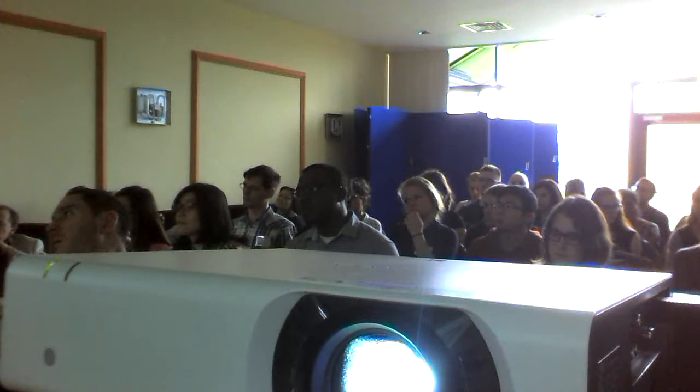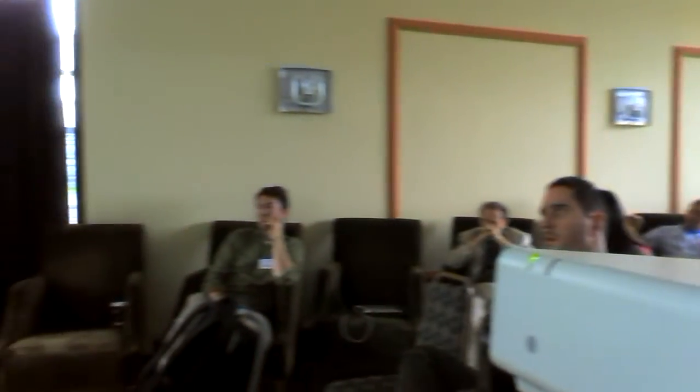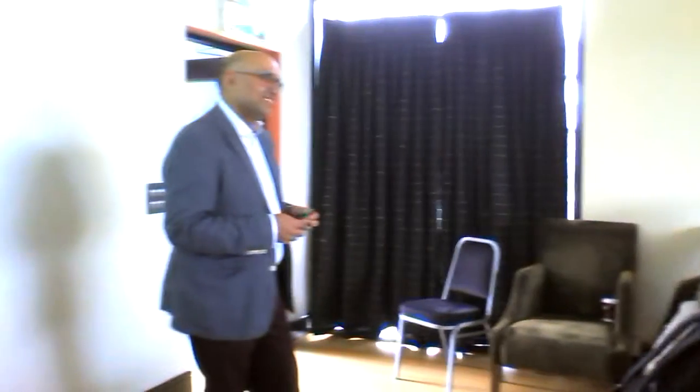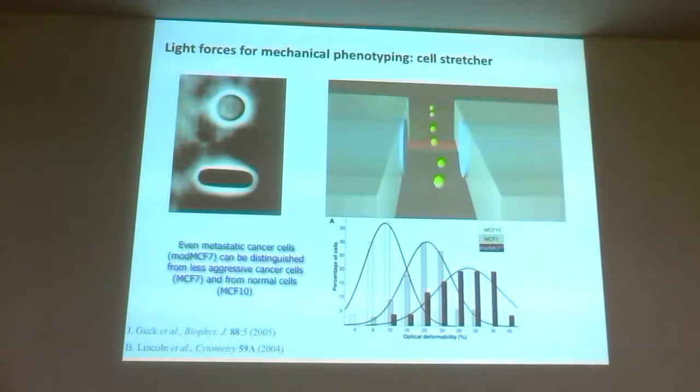We've not done any stretching ourselves, but we have done some stretching of red blood cells. It'll take maybe hundreds of milliseconds. Ah, okay, sorry, so the previous slide was not stretching? Yes, it was. You can see that the stretching is taking a little bit of time, a bit less than a second, I guess. It would depend on each cell. I don't know immediately of a paper that's compared a lot of cells for their stretching time, but we found red blood cells can take 100 milliseconds or so. Okay, maybe that's too long.